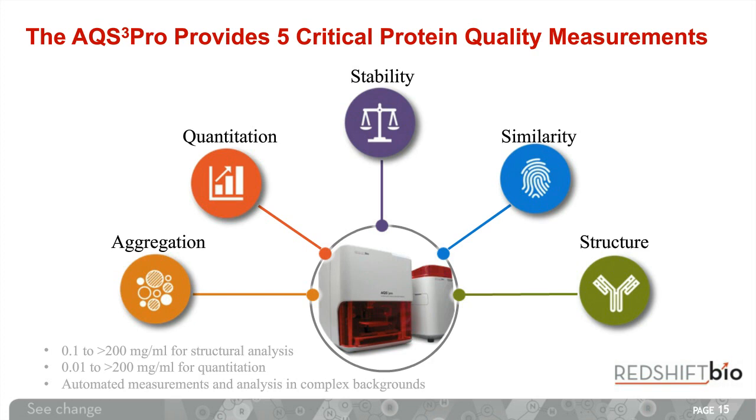We then make three other measurements that are actually all related to structural analysis. So we measure the spectrum across the amide 1 band and deconvolute this to provide us with secondary structure information, as we've just seen. We can then extract some useful information out of this data in order to construct a stability plot.